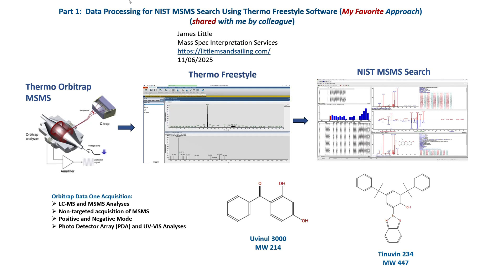This is my favorite approach and it was shared with me by a colleague. There are several other different ways one could use Freestyle to process the files and I showed that in a separate video.